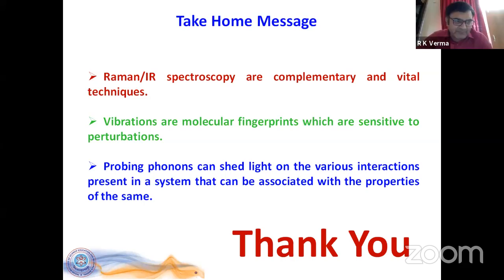Okay. There is a question from Marla Prasanti. She is asking, what is polarized Raman spectral analysis? In India, where can we get this polarized Raman spectra, and how can we interpret it? Well, most of the Raman spectrometers will have the capability to do polarization-based Raman spectroscopy. Polarized Raman spectrum means, when we talk about the monochromatic laser, often, if not every time, it is polarized light. That means the laser light will have a very well-defined polarization, and that is allowed to be incident on the sample. But the scattered light will have contributions of all different polarizations.